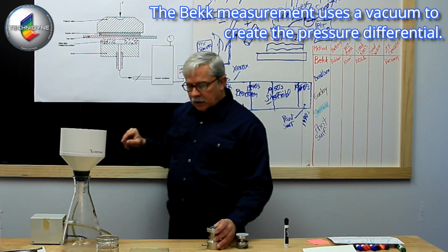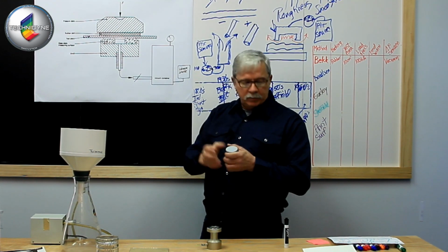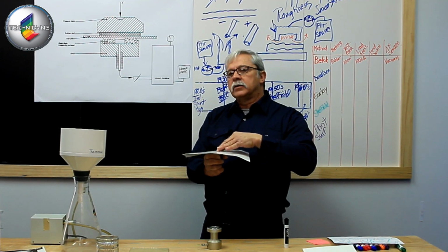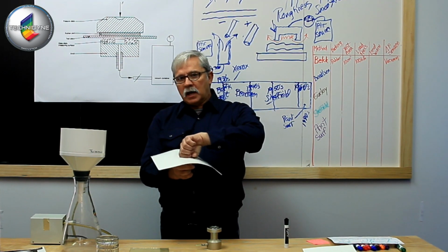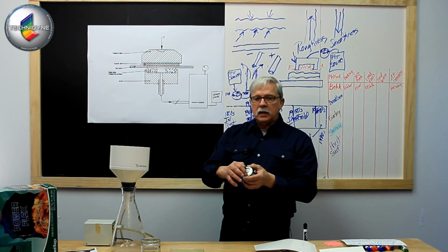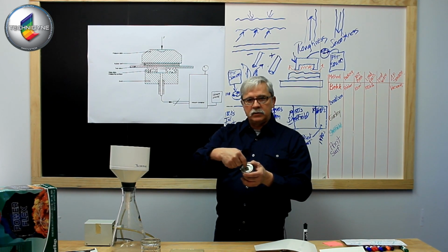He had a good, hard, firm platen to support the sample on one side. We need another part of that sandwich, my third layer, which I'm going to put on the top of this sample. In this case, we're going to utilize a circular glass platen that has a hole in the center.